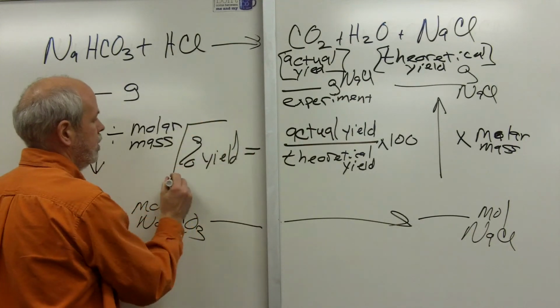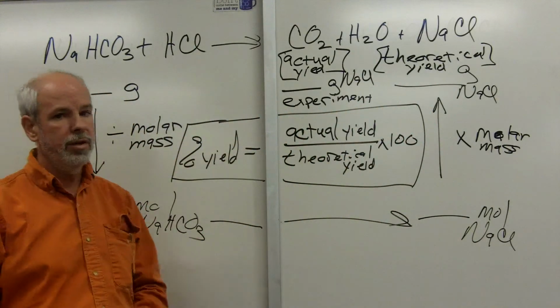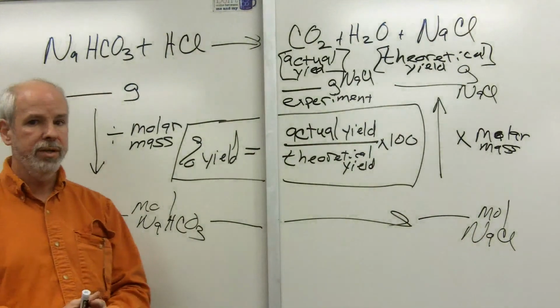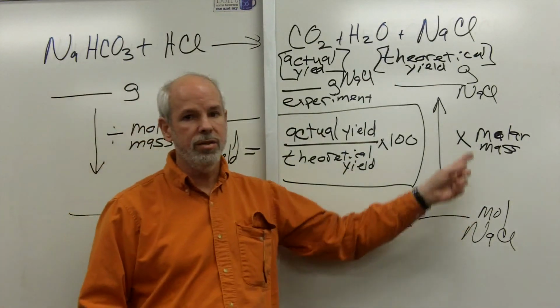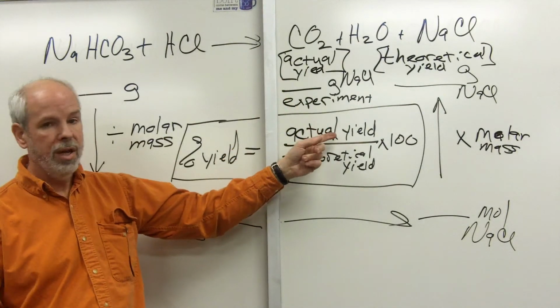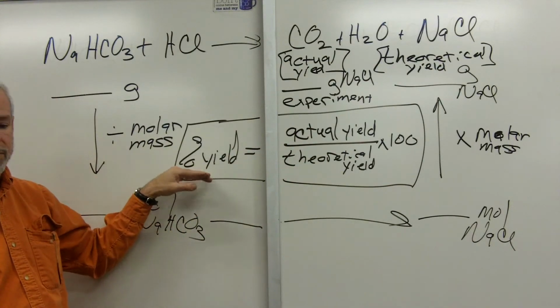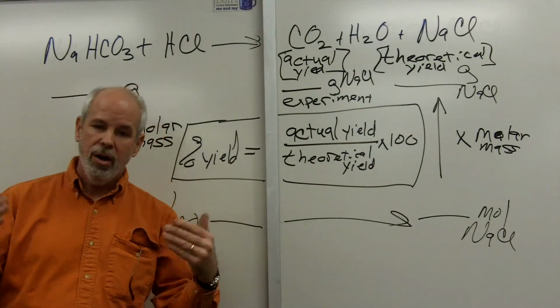All right, so here we go. So this is all separate. So our percent yield is what we'll get in the end, and in your data sheets for the laboratory, what you'll find at the bottom of the data sheets are spaces to do all these calculations for the theoretical yield, and then you'll have a little table where you can put the actual yield and theoretical yield, divide them and everything, and get the percent yield. Okay, now experimentally, all the procedures are there.